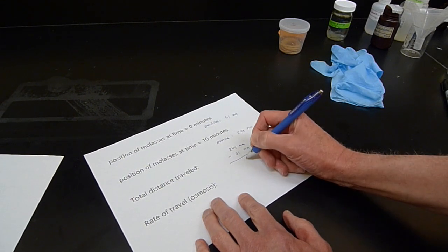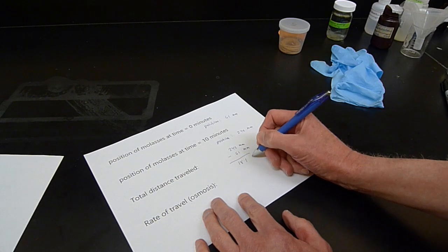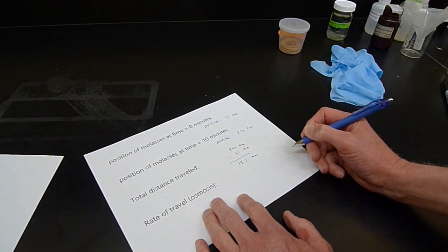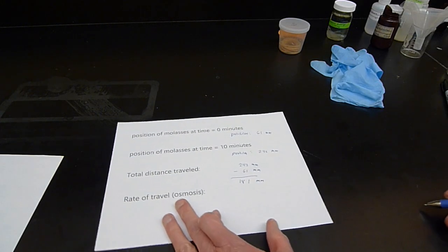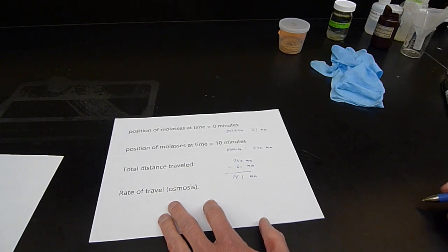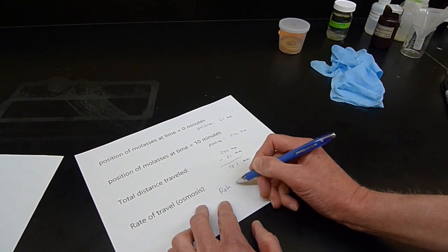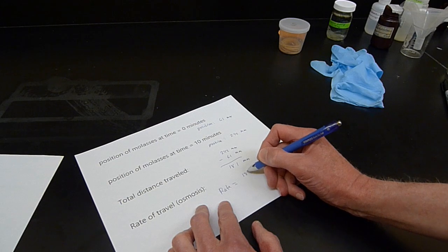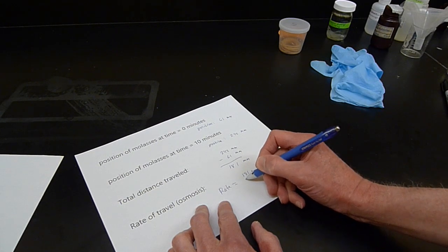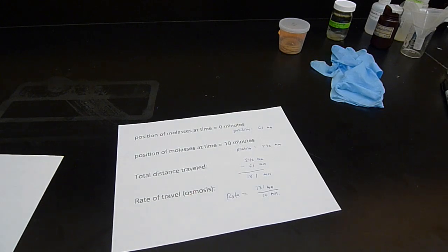See if I can do the arithmetic in my head. This is 181 millimeters it's traveled. So this is the total distance traveled. Again, I'm going to put this in a table for you. Everything will be summarized in a nice, neat fashion for you. So the rate in 10 minutes would be equal to 181 millimeters divided by 10 minutes. And you can do that arithmetic.